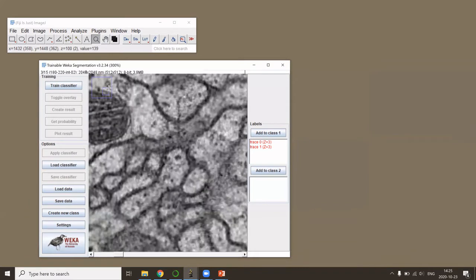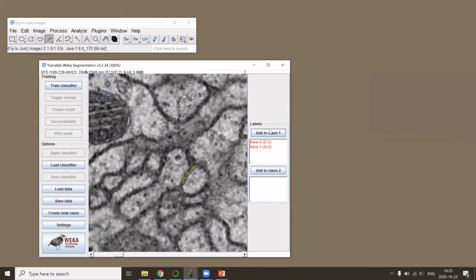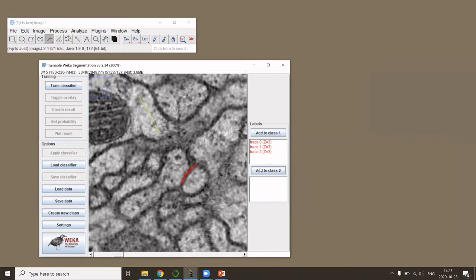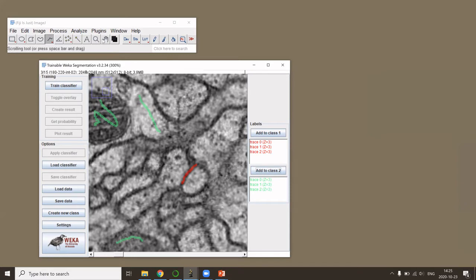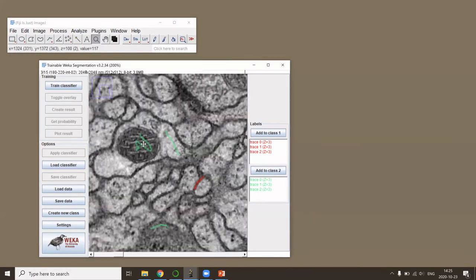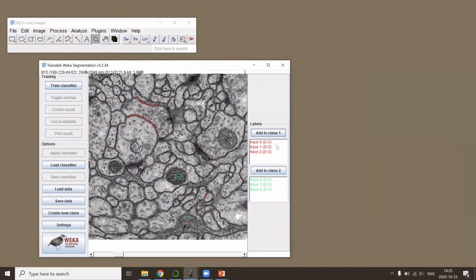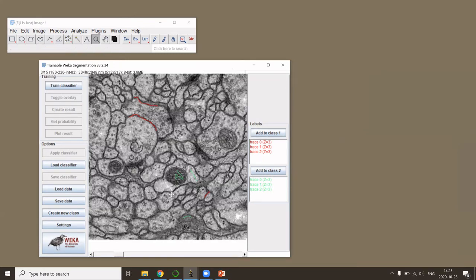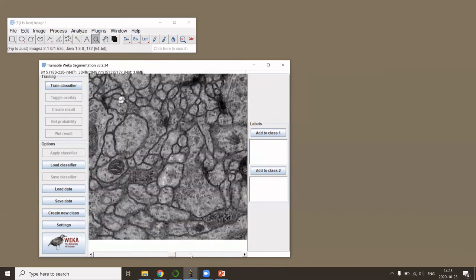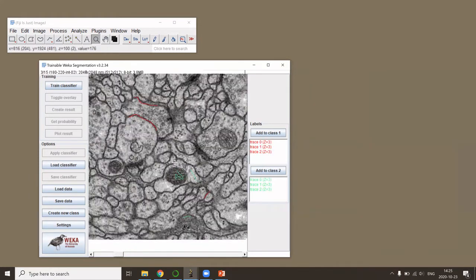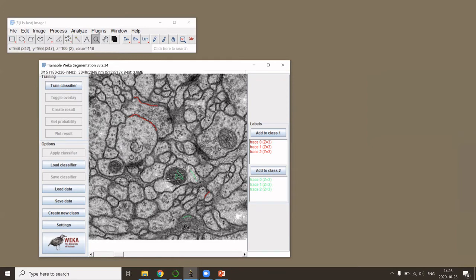Then I would do the same with the second class, which in this case will be my background. As always in pixel classification, I try to have equal amounts of pixels in both classes, and I try to pick pixels from different parts of the image. I could also include different slices in order to catch all the variations that membrane pixels can have.